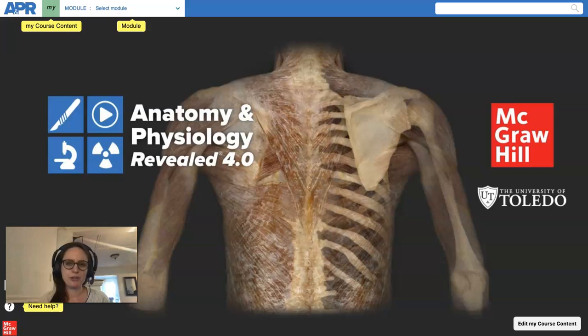So today I'm going to walk you through a virtual dissection. Now, my understanding is that at Northwestern we have stopped using fetal pig specimens entirely, or any kind of fixed specimens using formalin. We've moved to either a grocery store dissection model or something like this, a virtual anatomy, virtual dissection model. And that's acceptable.